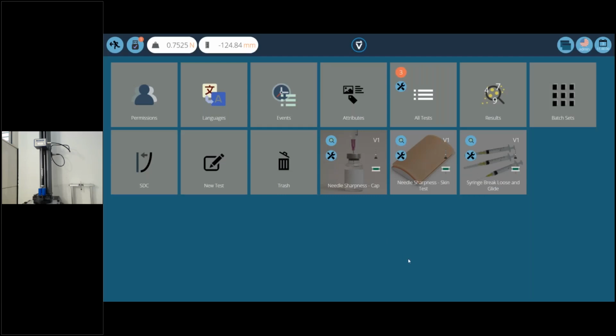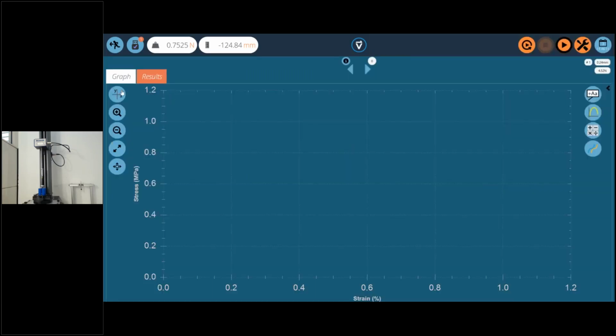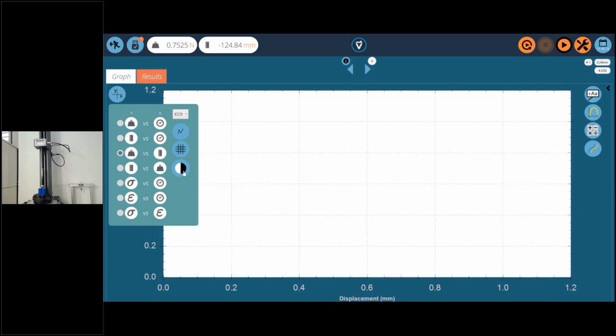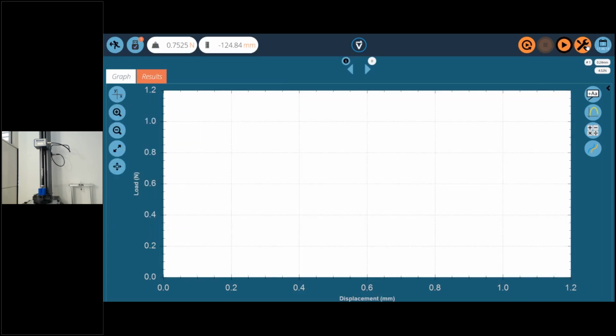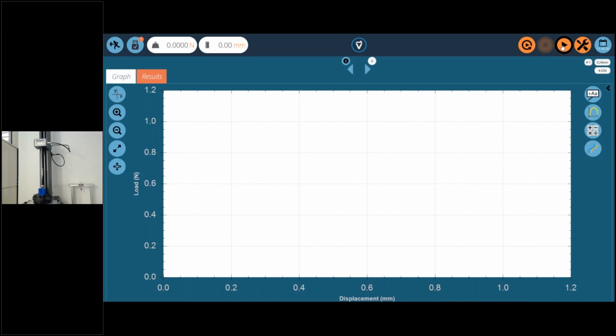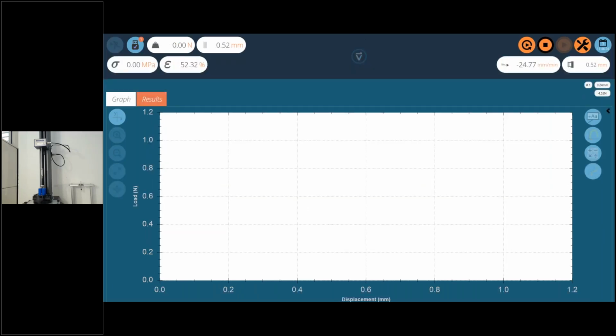Now, the cool thing is, once you configure the test, for all future subsequent testing, all the operator has to do is come in and select the test. It goes in. We're going to change the contrast a little bit. There we go. First thing we'll do is set the home position so the system knows to return to the appropriate position where it will return to at the end of each test, and then run the test. So it's going to come down.